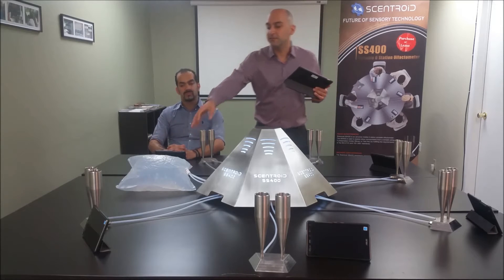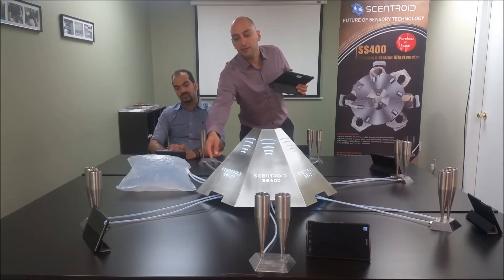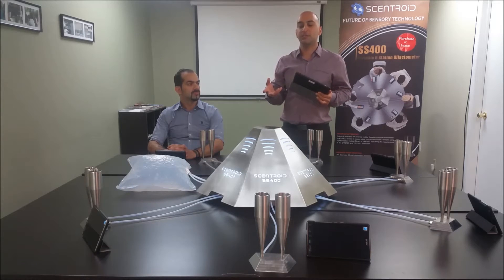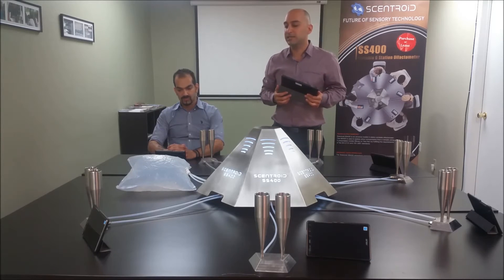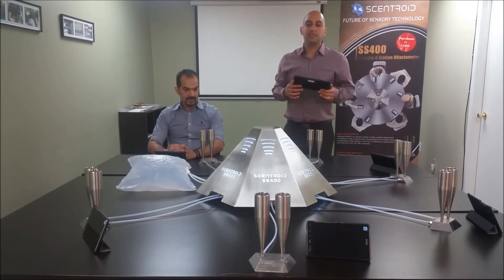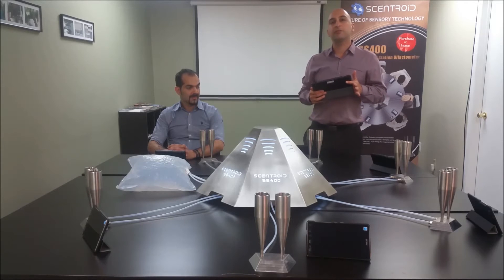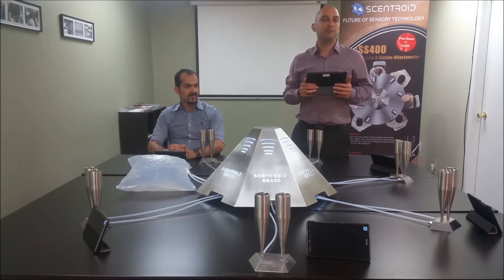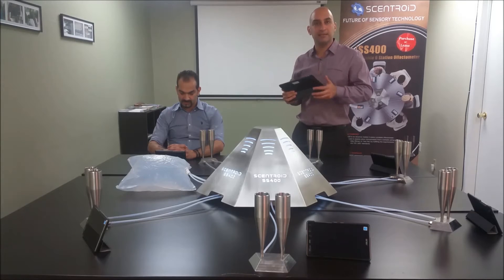The sample itself is connected here and it goes in. It is a pulled sample, so it doesn't need to be under pressure. The instrument will take it and an airline will bring the air in. It is designed to run with minimal air, so a small compressor that comes with it is capable of providing all the clean air that it needs.